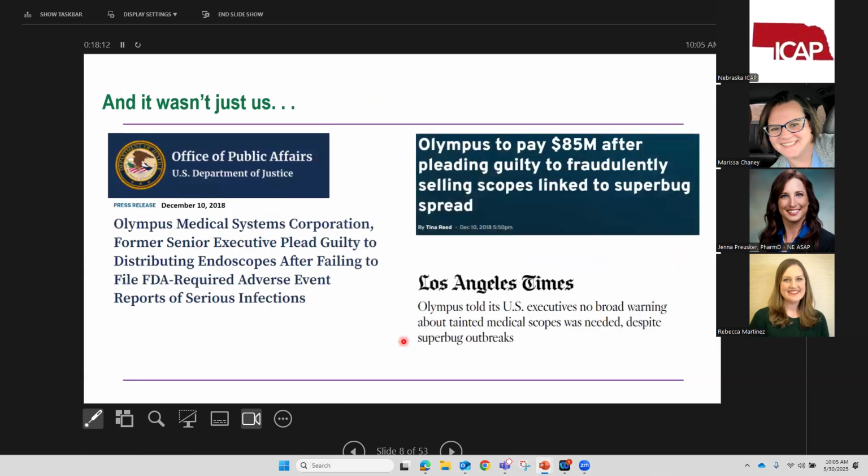This wasn't just us. This was a national outbreak. This was due to contaminated endoscopes. Olympus is under criminal investigation for this series of outbreaks.